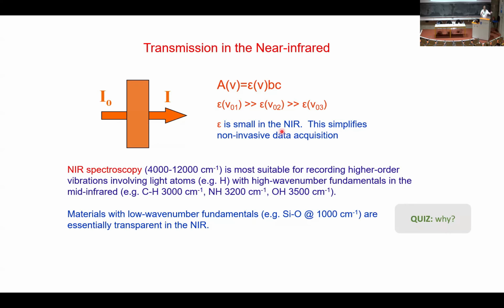in the near-infrared spectrum. By the time of the overtones, they are so high that they're negligible. So in the near-infrared, you will only see OH-related modes. It's like doing proton NMR in a sense. Coming from the structure OH groups and from the water in the structure only, without direct perturbation, without observing the SiO part, and also without observing any anhydrous accessory mineral that may be there. Quartz, carbonates, whatever. So it's made for studying clays.